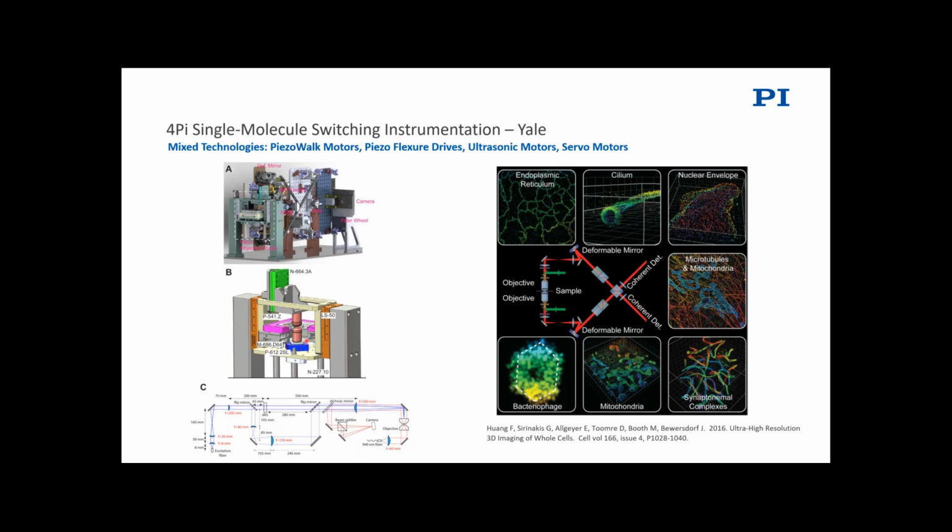But really, on this or SEM, TEM, all these advanced techniques, we want the motion to be as precise and stable as possible. There's a lot of imaging and tricks you can do with the data, but you want to start from the most noise-free and precise place possible.